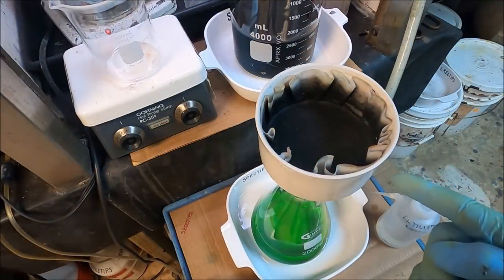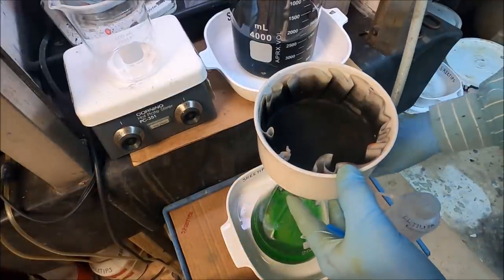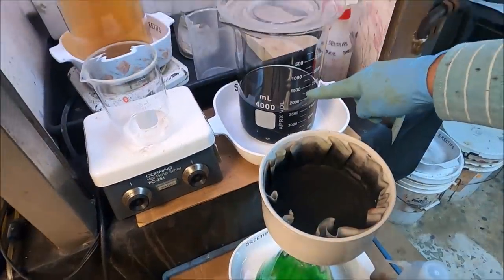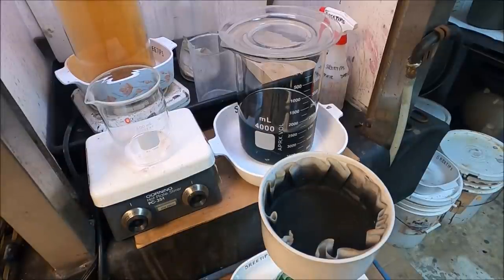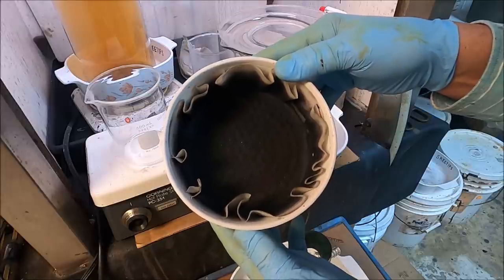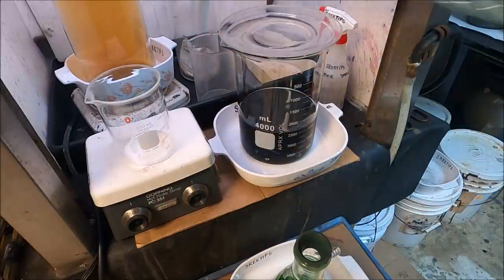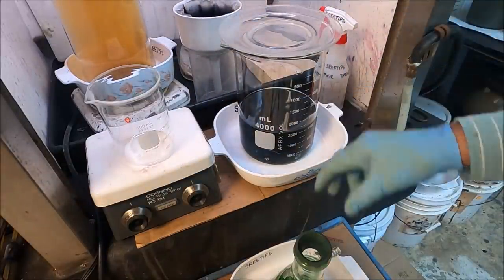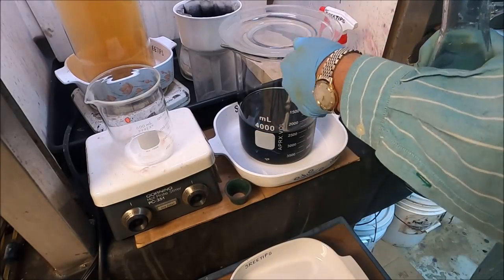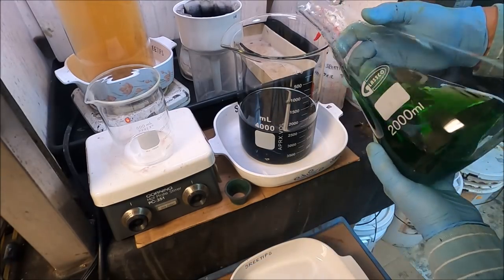Got everything pulled through the funnel. What we're going to do is set this funnel aside, and we're going to add this solution up here to this beaker. The black material in here will be precious metals. I don't know what all's in there. I'm not going to worry about this right now. First thing I'm going to do here is try to precipitate out the palladium out of this solution with some DMG. I'm going to add this solution to the beaker.